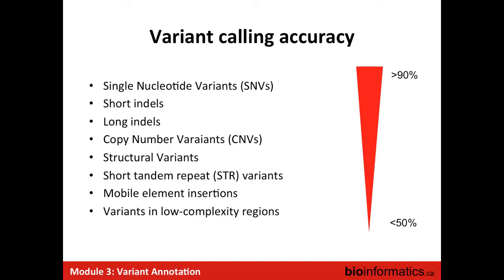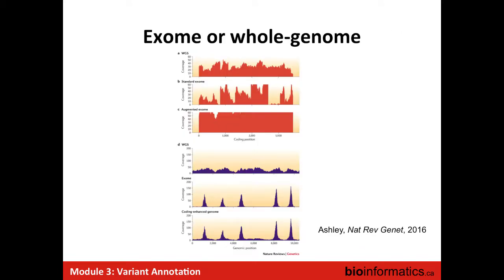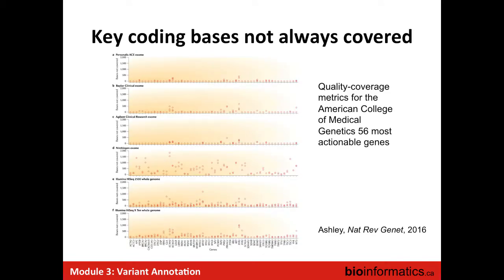I mean, to be fair, with the 150, especially paired end, there's not much of the genome that's not mappable, right? Okay. But even if you're missing 5% of the genome, there's still the chance that that's where the mutation you're interested in is. So how do you weigh that in? Yeah, it's hard. I went back and forth, but again, how do you determine what's enough, right? So you're missing just 500 nucleotides in these genes. Is that a problem or not?